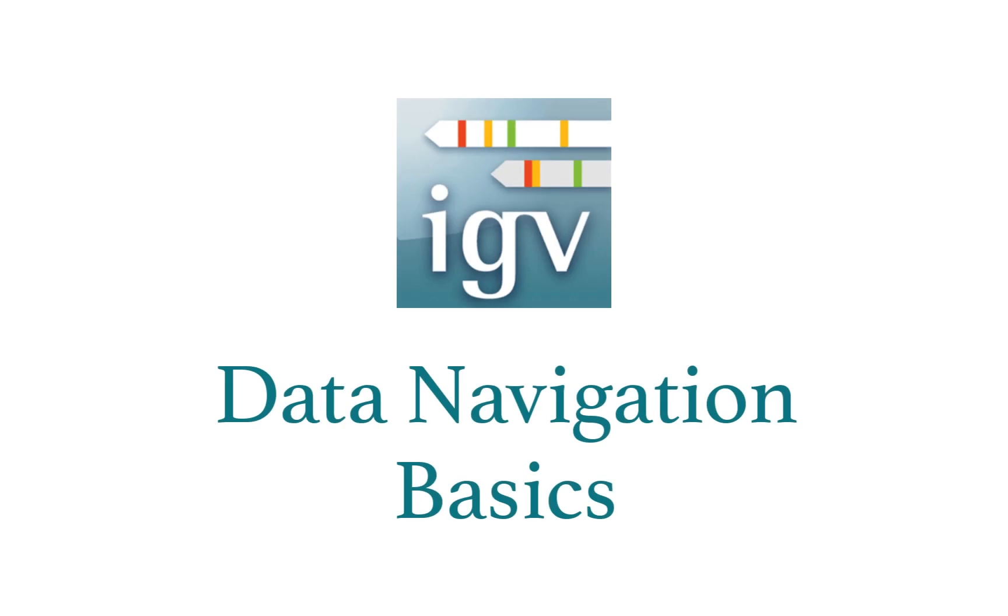Here we'll show the basics of data navigation in IGV. Throughout this tutorial, you can simply watch or open IGV and follow along.